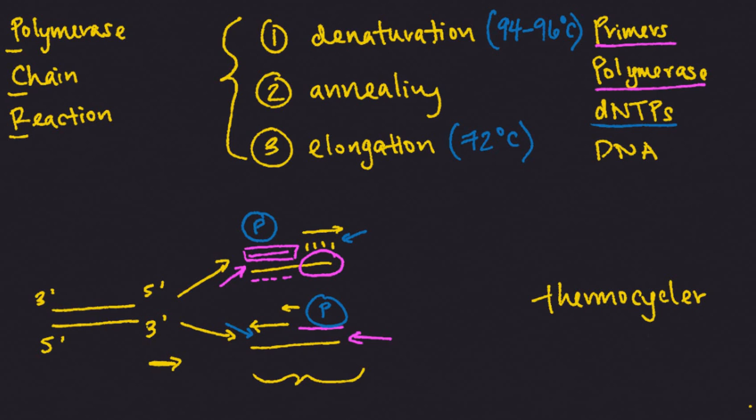strand, in theory. My molecular biology teacher always used to tell us that she would literally fail us if we asked for more DNA, because you should never ever run out of DNA with PCR as long as you have a single strand. It's almost like magic.